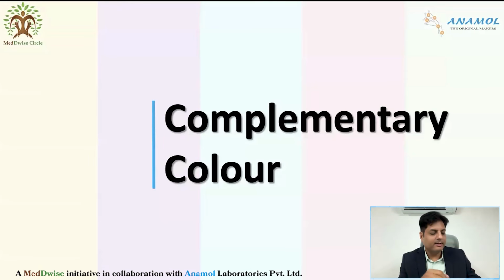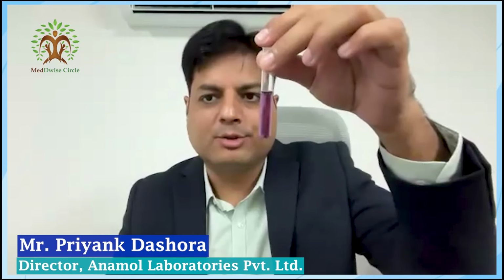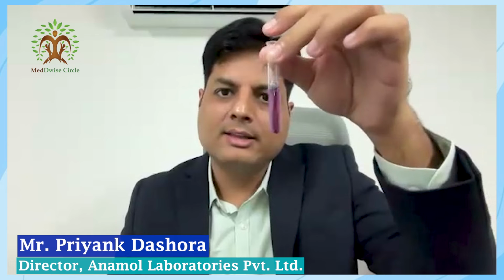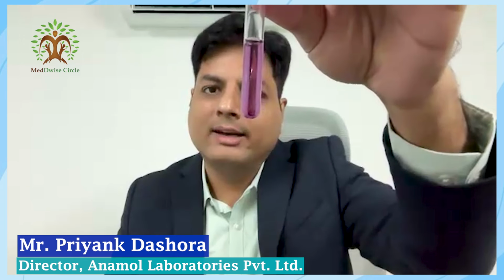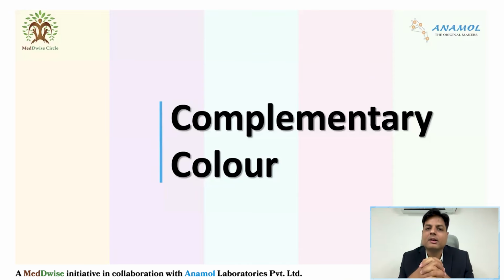So friends, I did show you the example of a test tube. As you can see, in this test tube, the liquid which is there is slightly violet in color. Now, think about it. If the solution is violet in color, and we pass violet light through this solution, will it absorb the light?